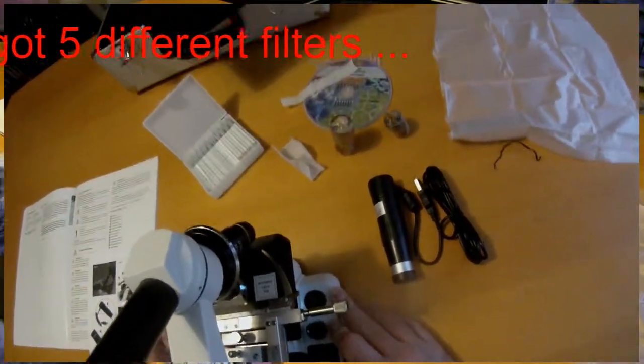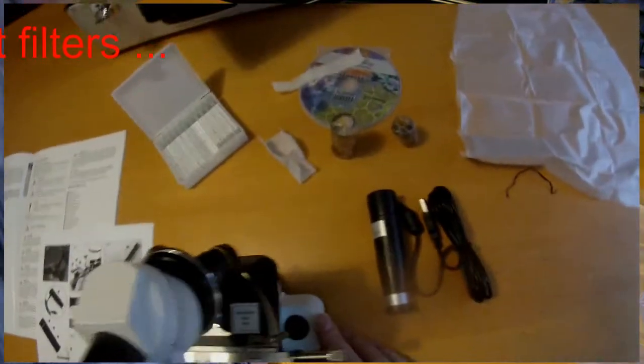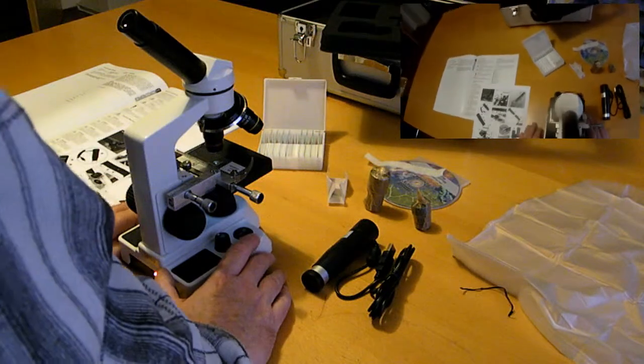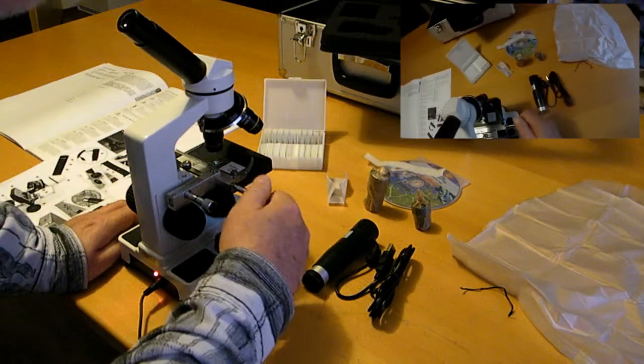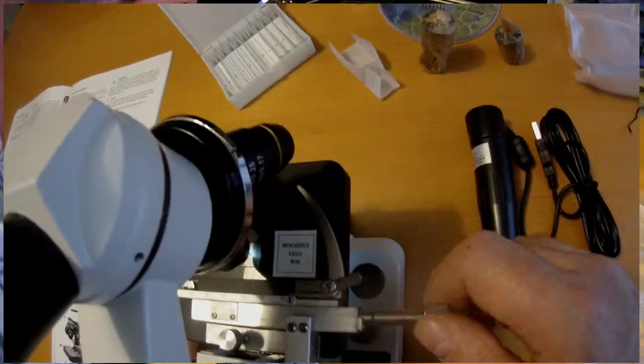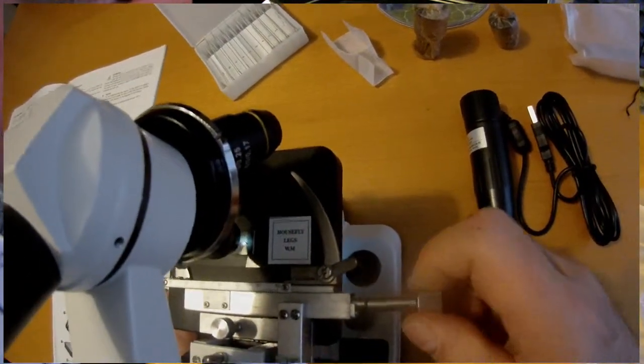Is it going round? Yeah, it's going around. Okay, let's leave it like it is now. And you see how this leg of a housefly moves smoothly around.